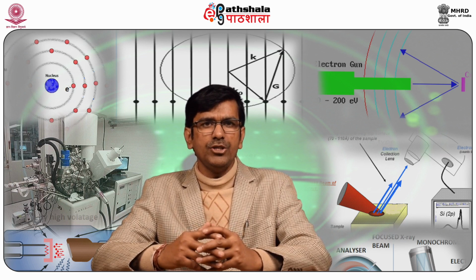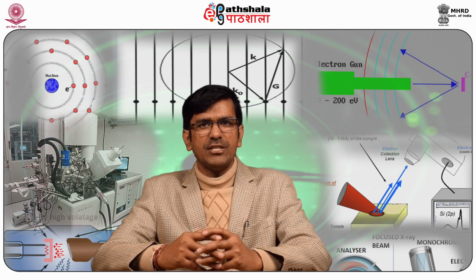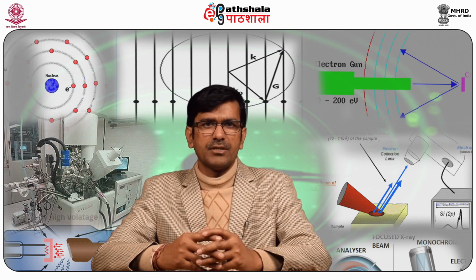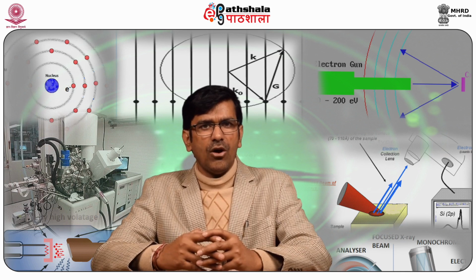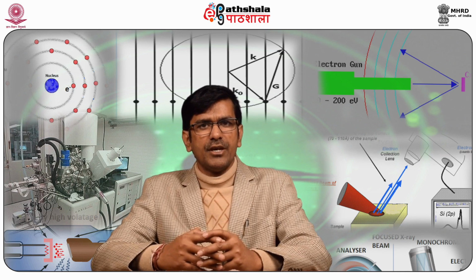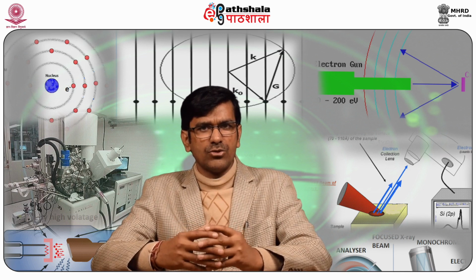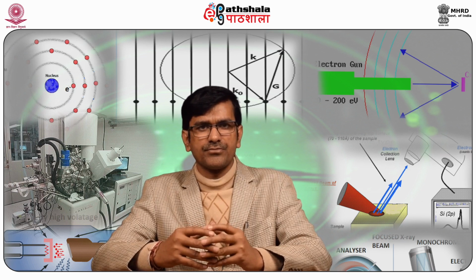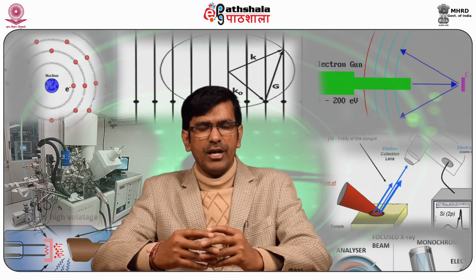Now about the new developments. Besides the helium first and second line sources, other sources with small natural widths but still higher energies will be developed so that all molecular orbitals can eventually be studied with high resolution. The variety of available soft X-ray sources will also increase, some with natural width of only a few tenths of electron volts.